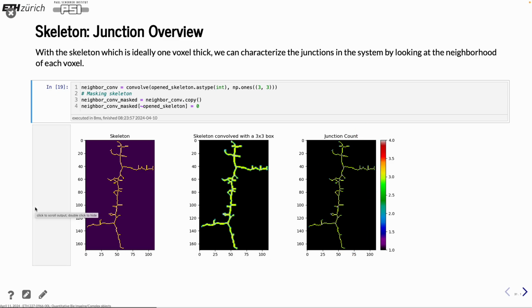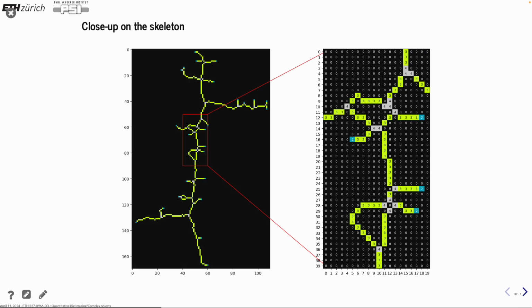And now the light is not ideal, but you can see that the major part is this green yellowish, but out at the endpoint it's blue, and you probably have to see that on your own screens, but there are some gray points also at every junction. So what is happening now? Why do we get this?